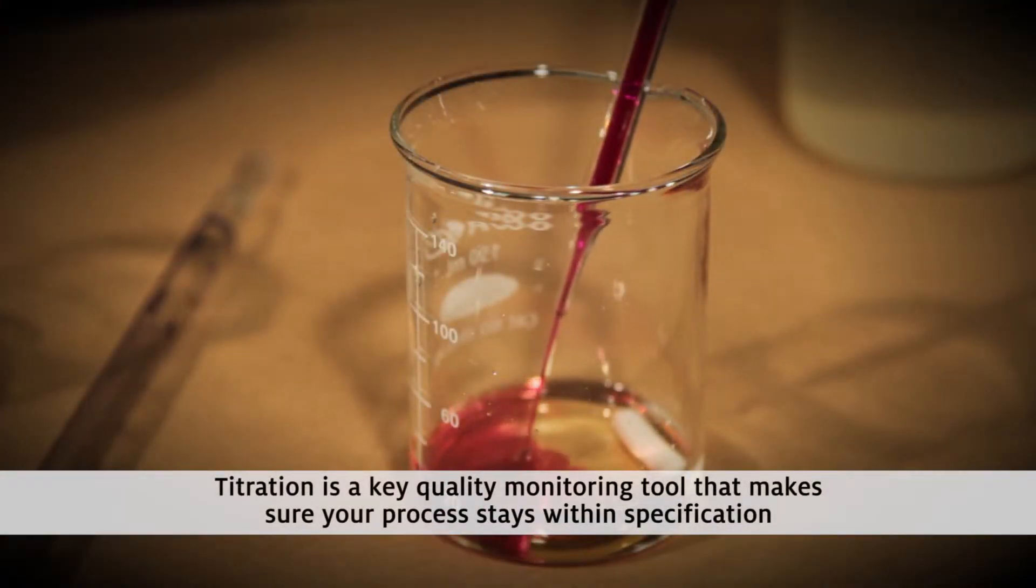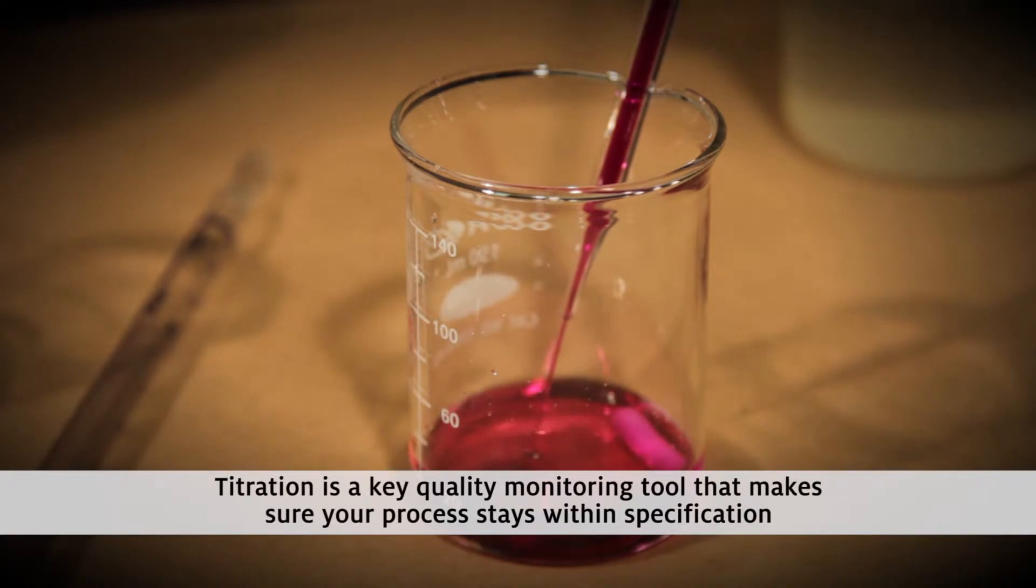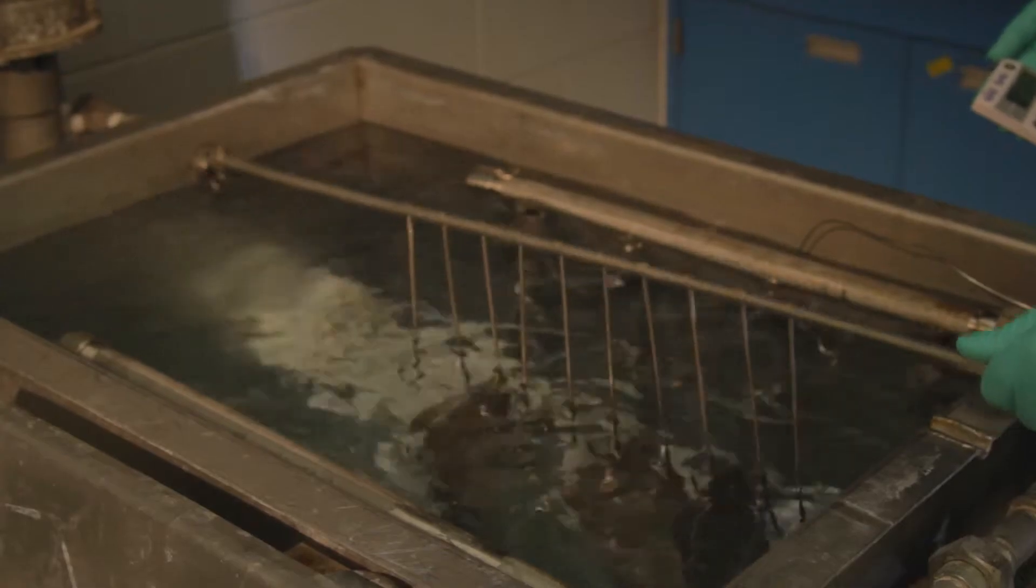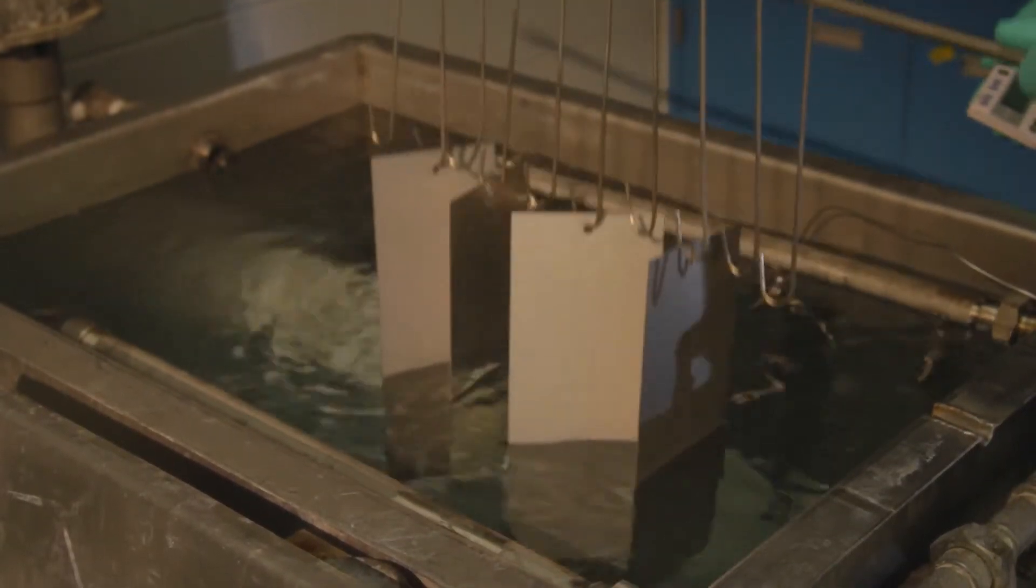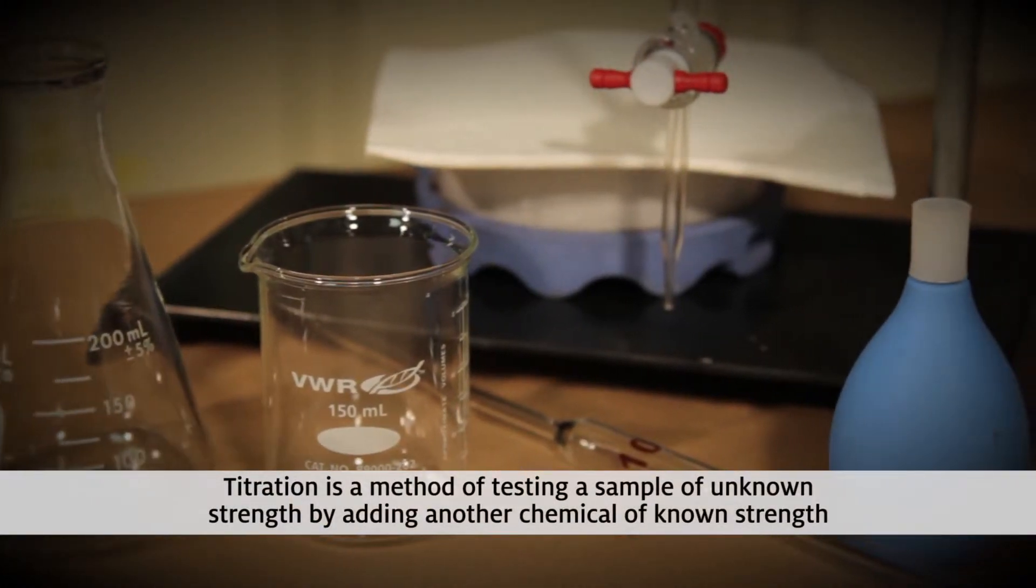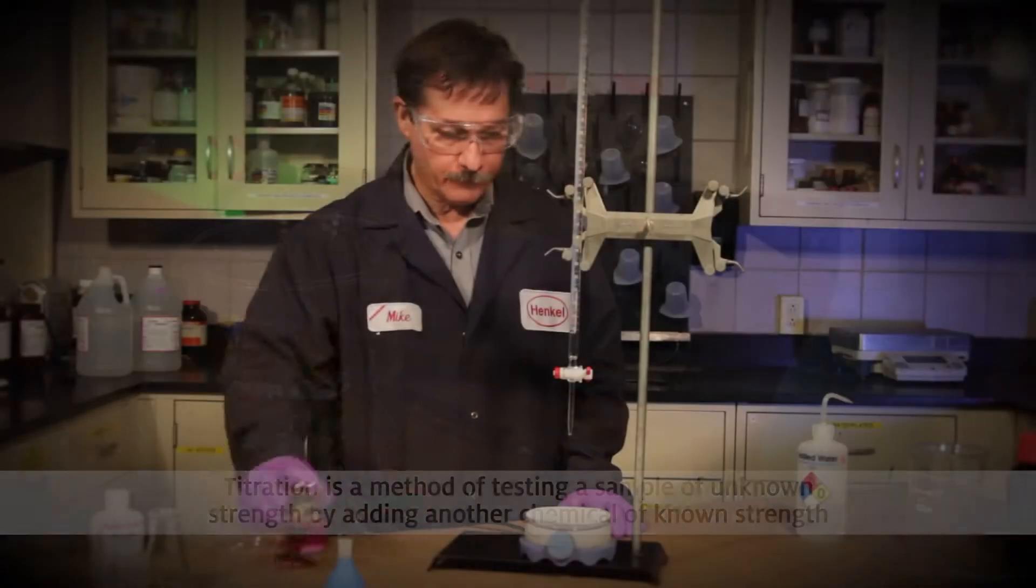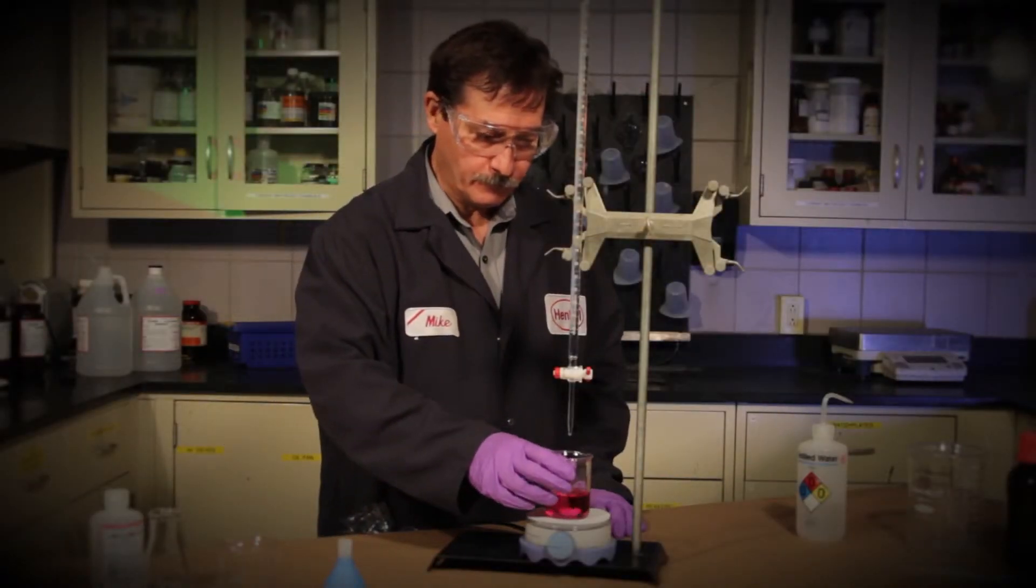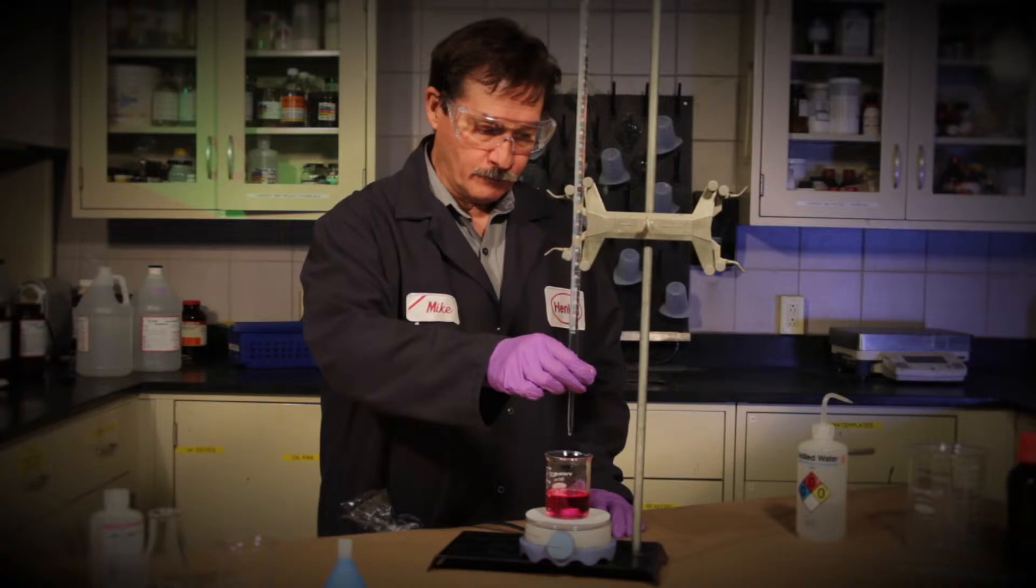Titration is a key quality monitoring tool that makes sure your process stays within specification and continues to produce quality parts. Titration is a method of testing a sample of unknown strength by adding another chemical of known strength. When these materials react with each other, the concentration of the unknown can be determined.